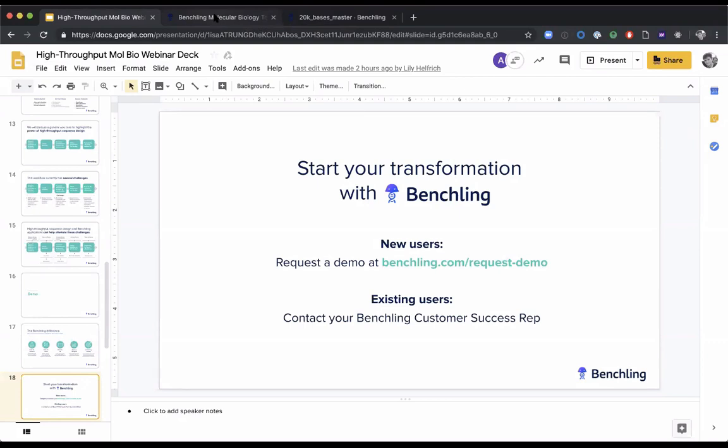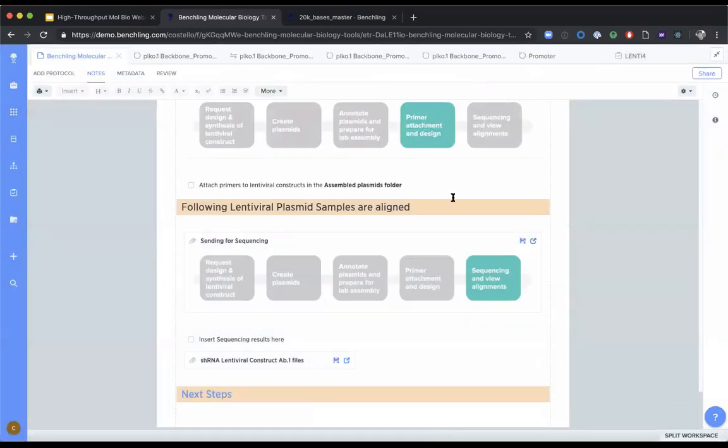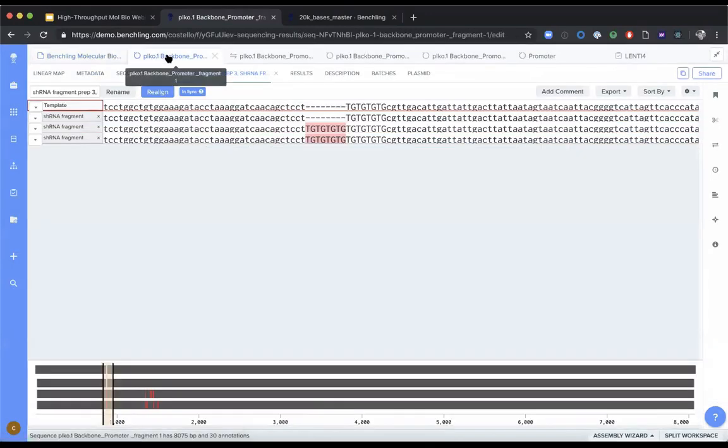So Damien, there were a couple of questions about schemas. Did you want to show what the purpose of setting a schema is, and how it allows people to have complex data models beyond the sequence itself? Sure, and I'd just like to call out that a schema is actually a concept involved with the registry itself.